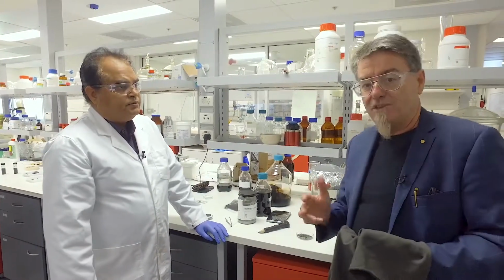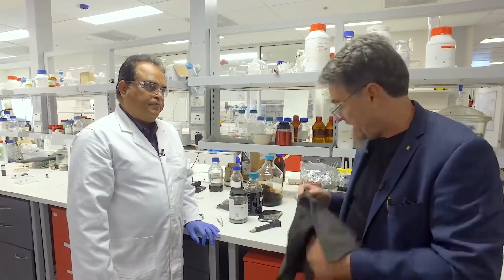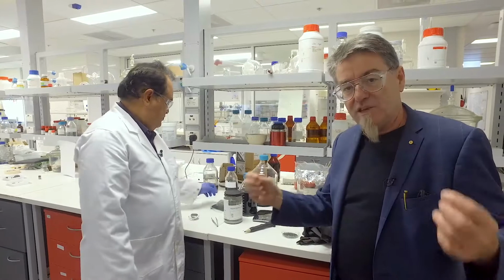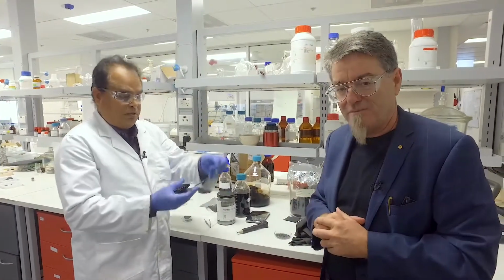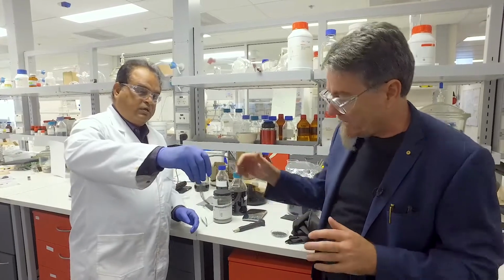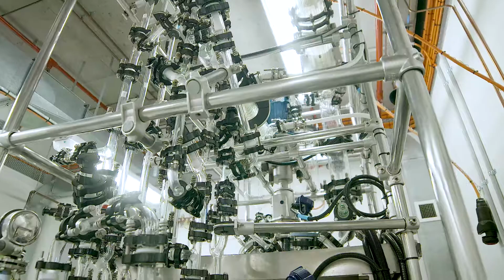And as Sanjeev mentioned, these same dispersions are what we use for fibre spinning, for creating long lengths of individual fibres, as well as for printing, either in 2 dimensions or 3 dimensions. And we're going to be looking at these processes in later parts of the tour.